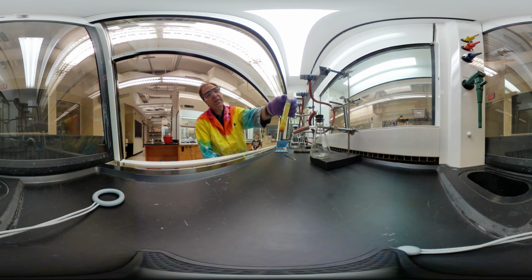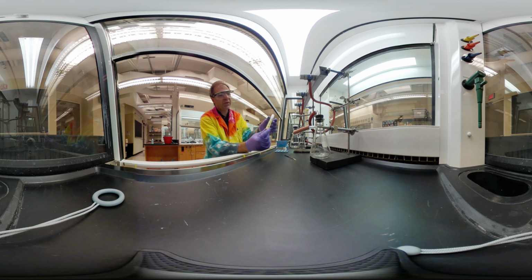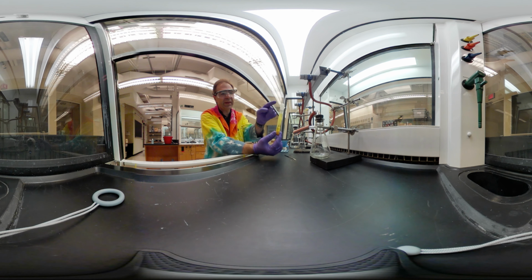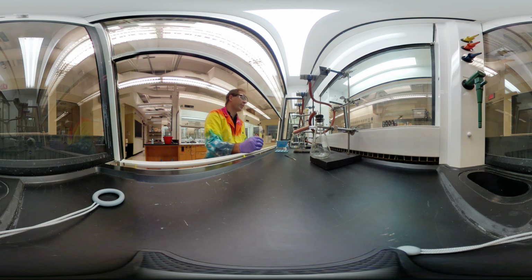So what you can see is as our reaction mixture cooled down, we had a good amount of this yellow solid form. And then I added the 15 mils of hot water once it cooled down below 100 degrees Celsius. And that quenched the reaction or stopped it from keeping going. And so what we want to do is collect this solid and get rid of most of the solvent. This is, or should be, intermediate 2 from the reaction.